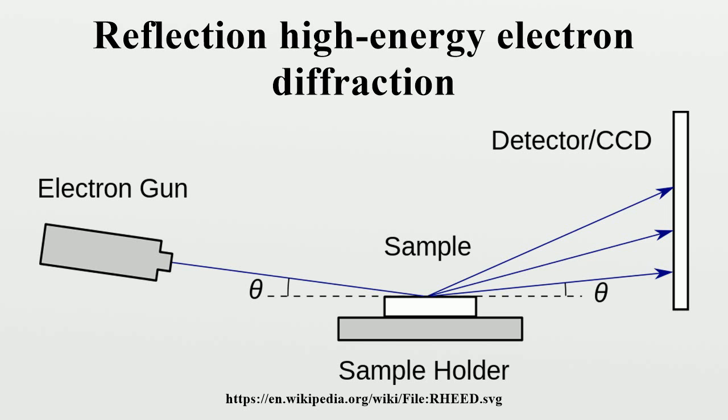Two types of diffraction contribute to RHEED patterns. Some incident electrons undergo a single, elastic scattering event at the crystal surface, a process termed kinematic scattering. Dynamic scattering occurs when electrons undergo multiple diffraction events in the crystal and lose some of their energy due to interactions with the sample. Users extract quantitative data from the kinematically diffracted electrons. These electrons account for the high-intensity spots or rings common to RHEED patterns.